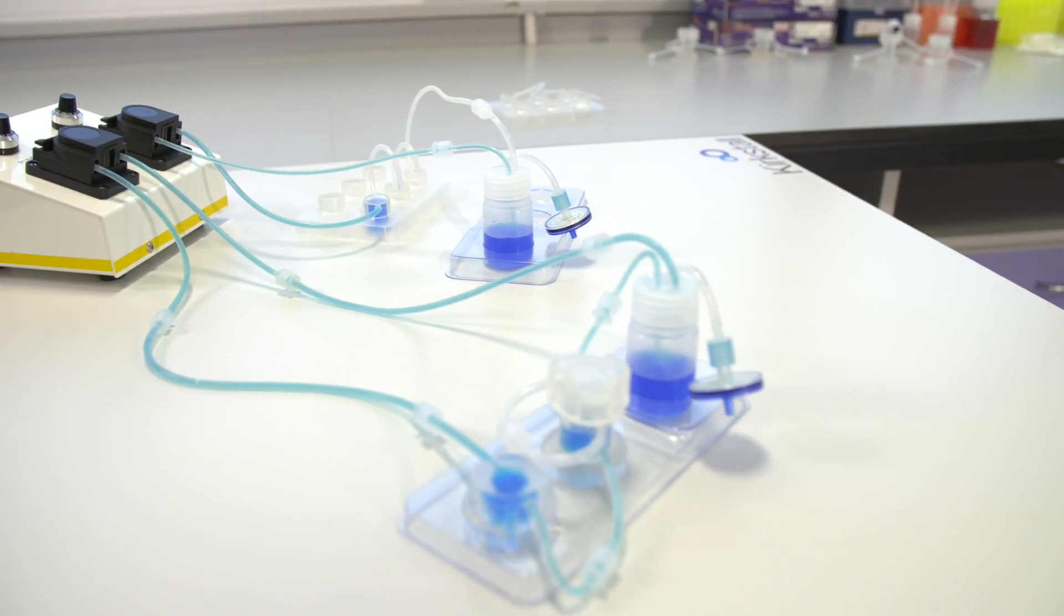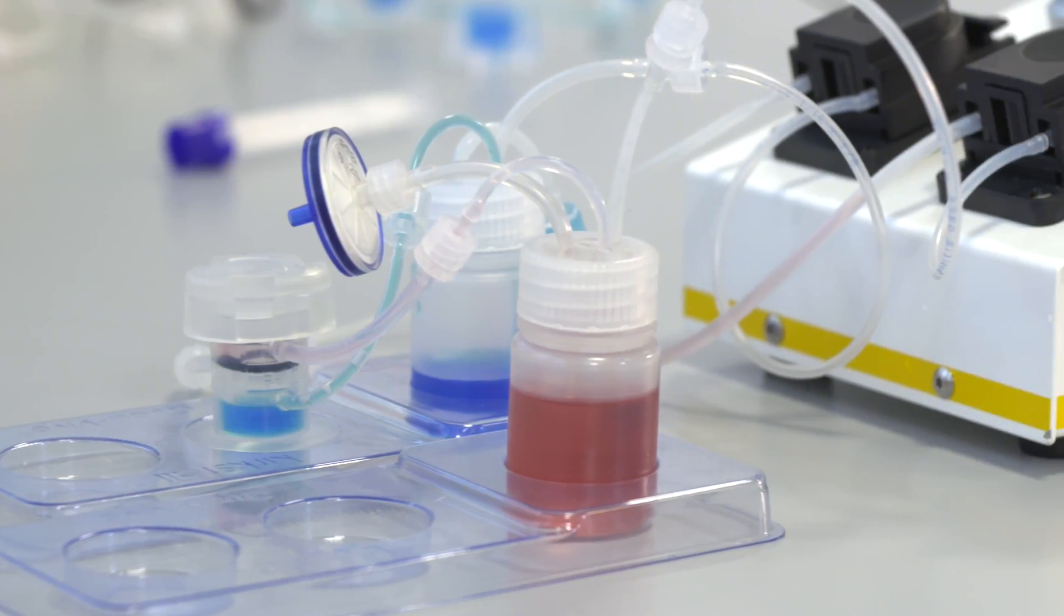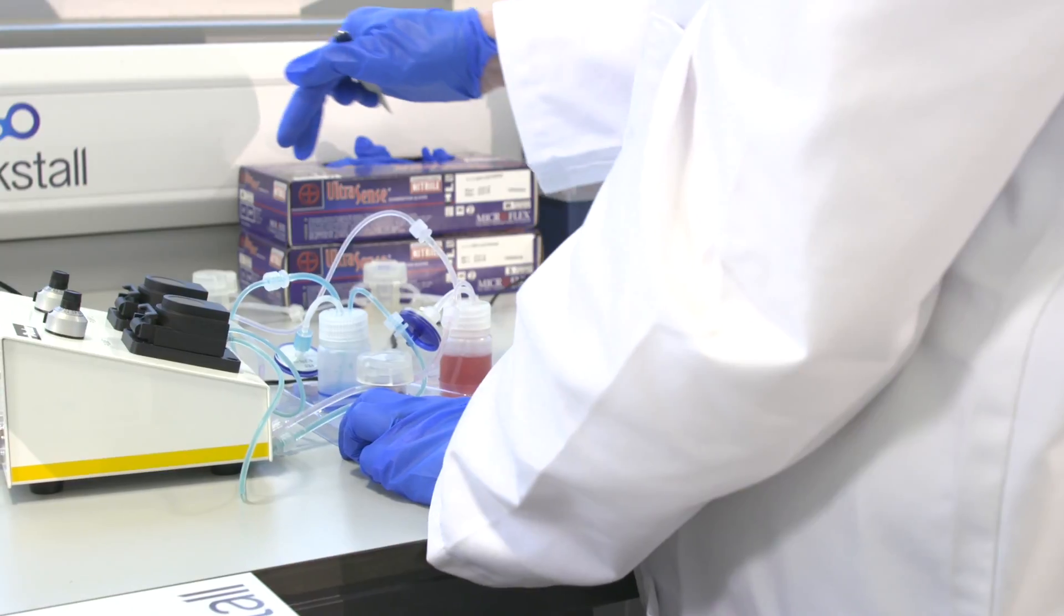Getting started is straightforward and cost effective. If you would like to find out more about how you can use Quasivivo to improve your research, please contact us.